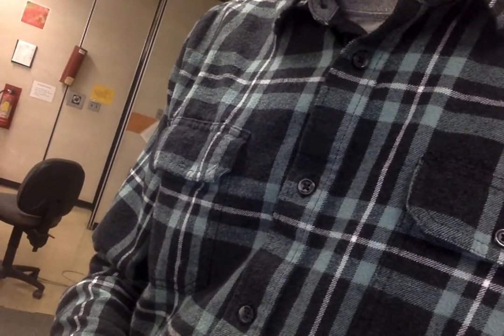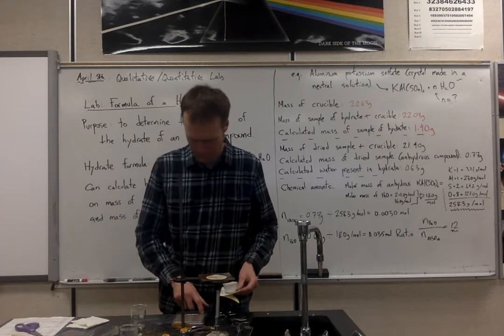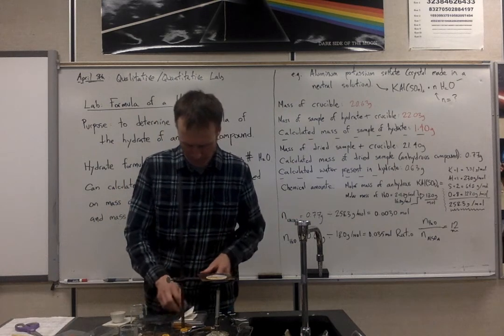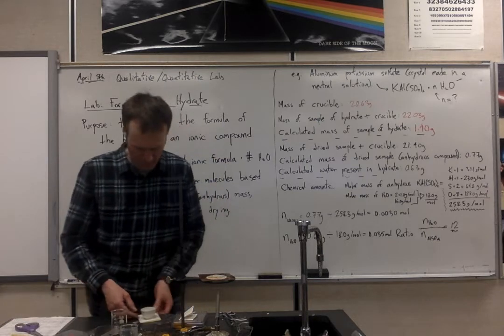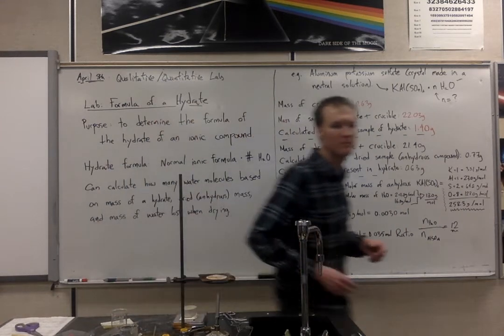Let's just have one more look. I'm gonna go with that.